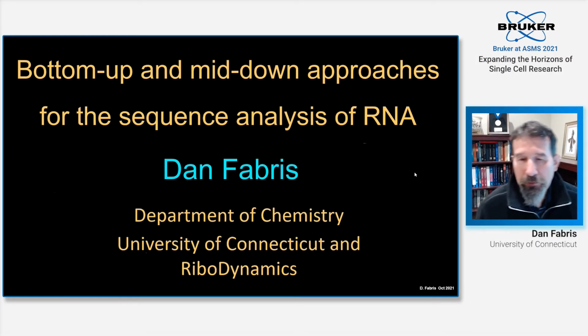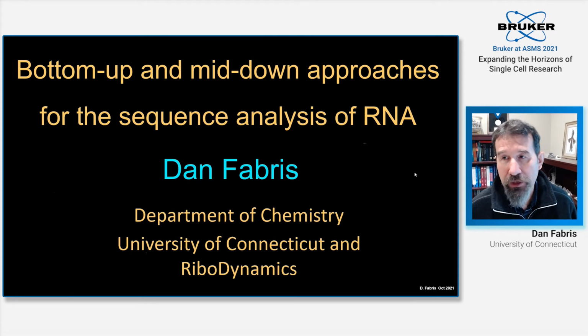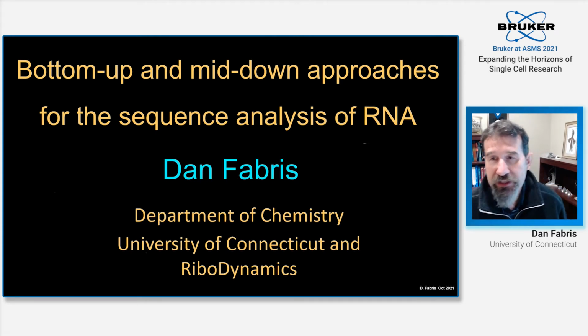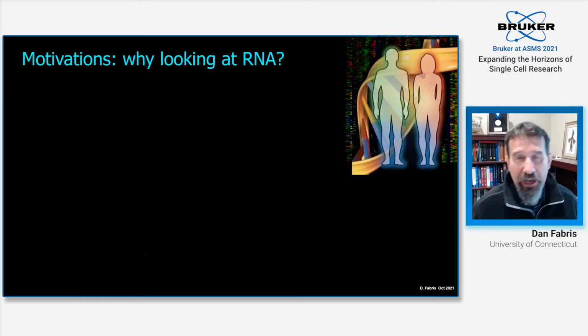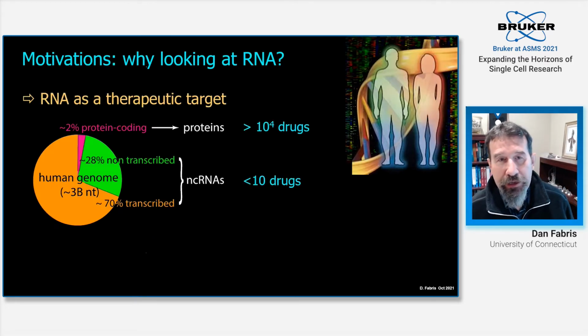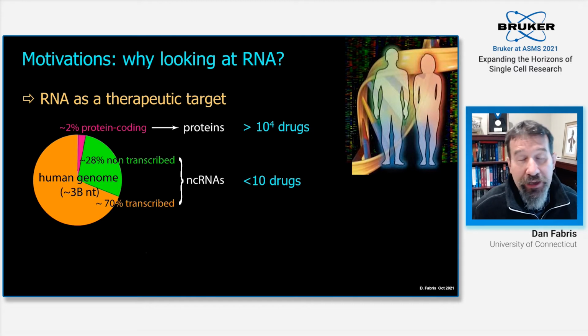Today, I would like to talk to you about some advances we've been making in my laboratory toward the analysis of progressively larger RNA analytes. And why are we so interested in RNA? RNA can be a very appealing therapeutic target.